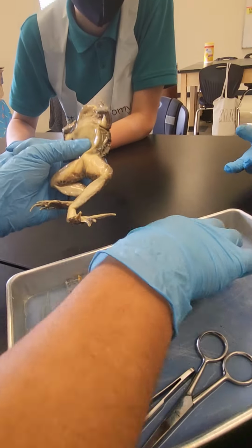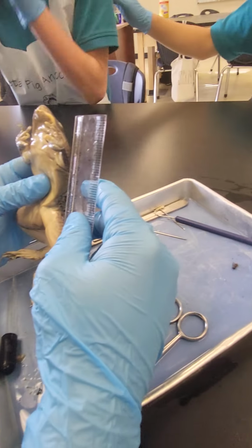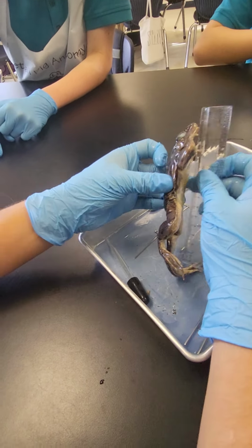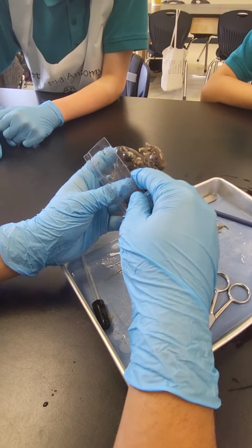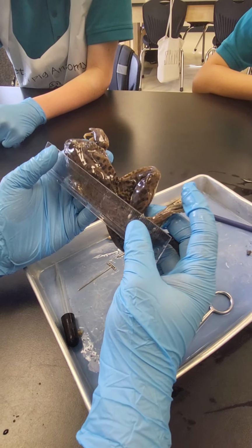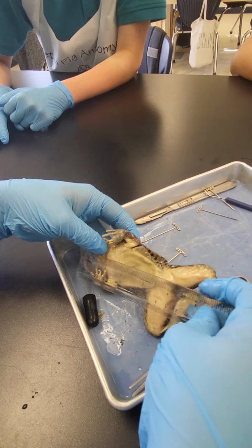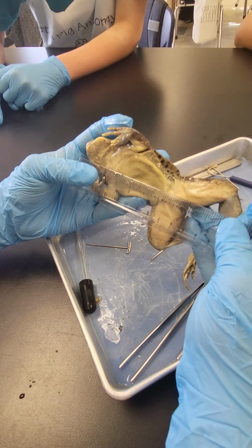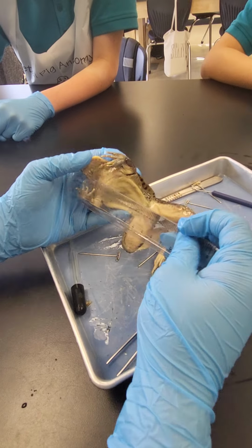Measure the specimen. From the head. To the toe or to the body? Use a ruler to measure. I'm gonna guess it right now. It's a female. From the tip of the head to the end of the frog's backbone. Okay, so not the legs. You have to move it a little bit more because the zero is not at the edge. Yeah, that's better. Just lay it down flat and that'd probably be the best way to measure. It is about 4 inches.